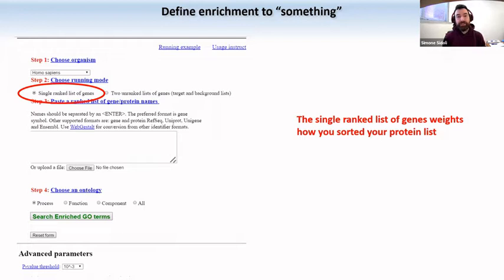So in that sense, whatever proteins you paste in this software, whether they are the upregulated, the downregulated, or the non-regulated, functional enrichment is probably going to give you muscle fibers, activity in muscles, right? And this is misleading you because it's not telling you what is specifically upregulated in your data, compared to the rest of the proteins that you detect. So I'm going to show you a practical example at the end of this presentation. Just keep this in mind.